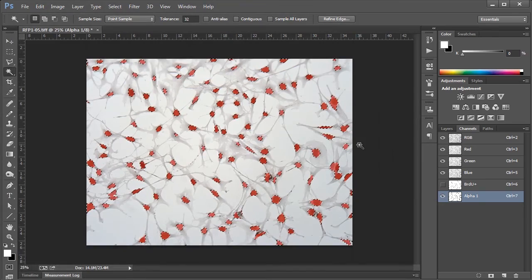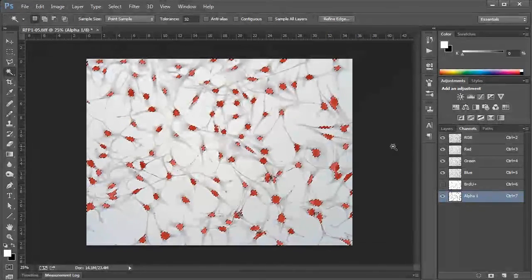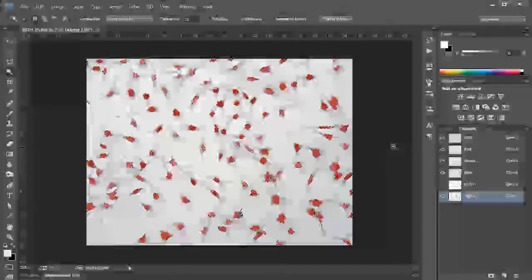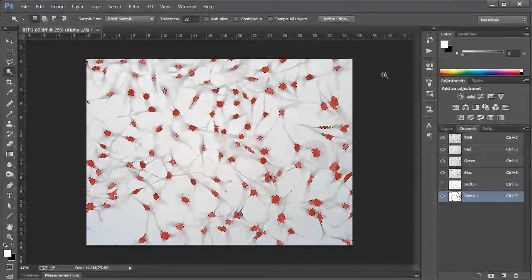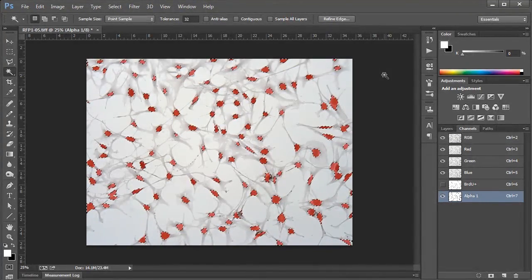So I think that pretty much does it. I know I went kind of fast today, but I think once you go through it on your own and play around with some of these commands you might not have been totally familiar with before, you should get a hang of it no problem. Hopefully in a future video, I can't remember if I had mentioned this before or not, I'll show you we can program all of this into an action, which should make things even quicker.